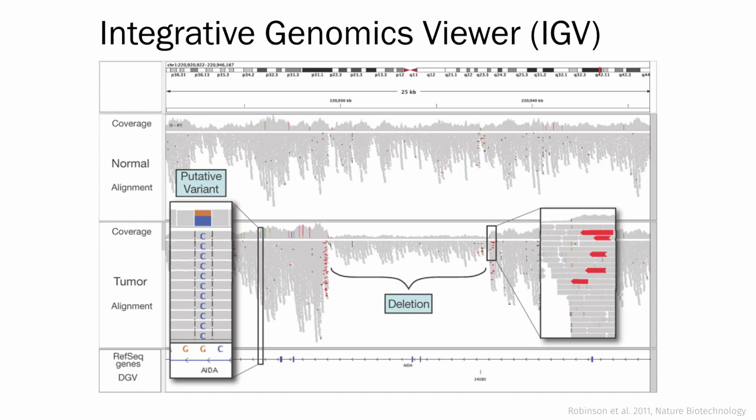So this is also one of the reasons why there are so many visualization tools for genomic data, because we have to deal with very diverse scales, from the whole genome down to individual nucleotides. That is challenging from a visualization point of view, because obviously you cannot squeeze, in the case of human genomes, 3 billion nucleotides on a screen and then expect anyone to see what an individual SNP might be doing. Okay, this is just to motivate this a little bit.